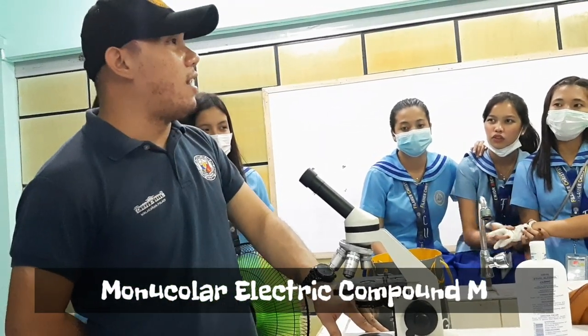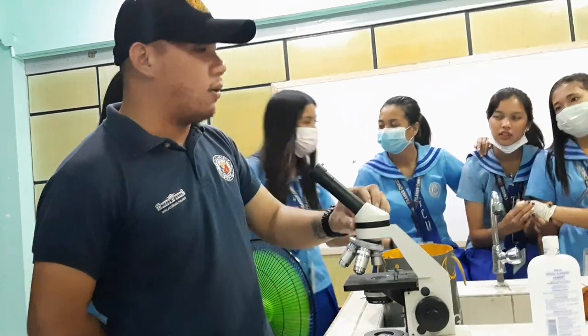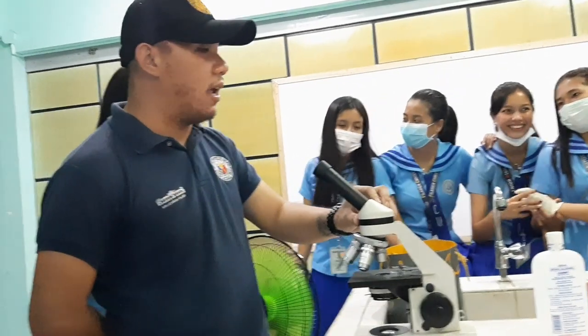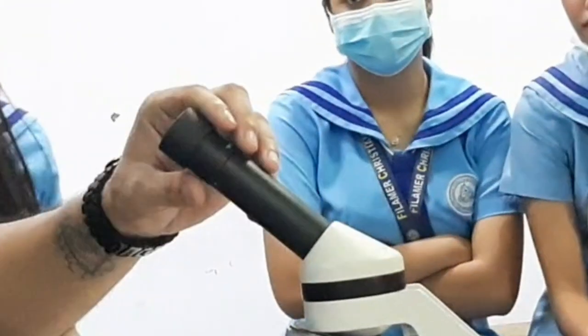This is a monocular electric compound microscope. So that is the full name gidya sa muninga microscope. Okay? Monocular siya to the sense that it only has one eyepiece. Kung duwa kapilog ang iyang eyepiece, ang imo ginalantawan, binocular. Binocular. Wow. Smart. Sana all. Okay? Okay, so let's be familiarized with the parts first. So this one is the eyepiece.